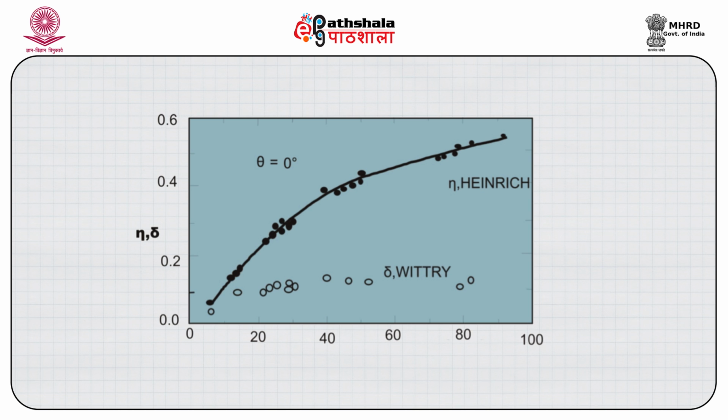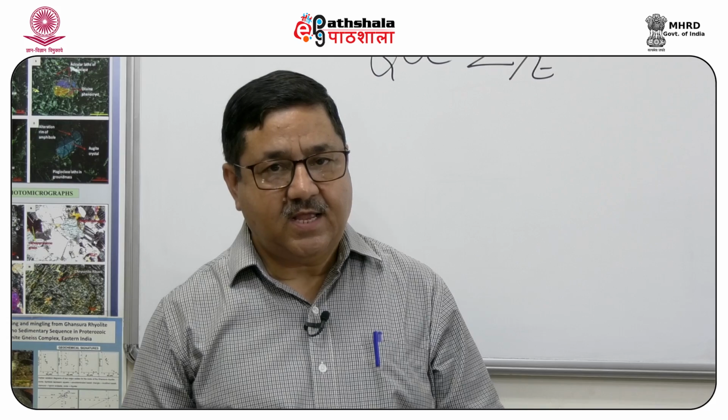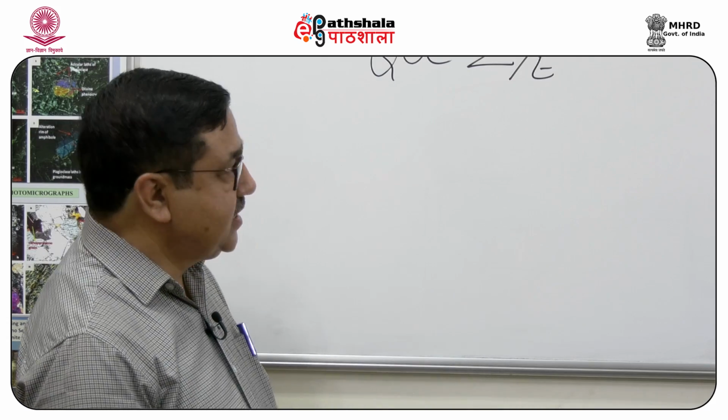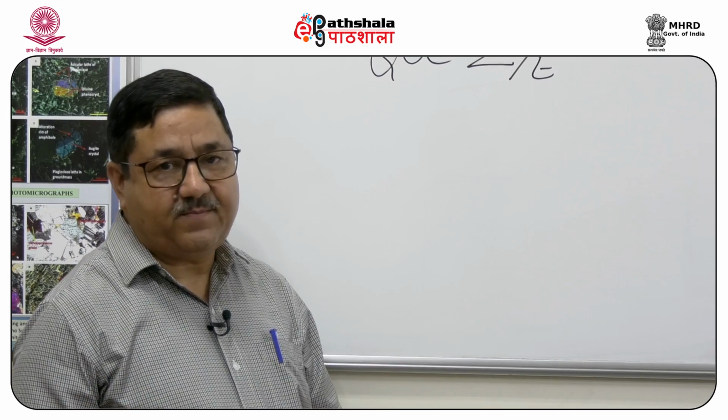And if we get this in the form of a gray tone image, we will be able to distinguish the brighter parts as higher atomic number.